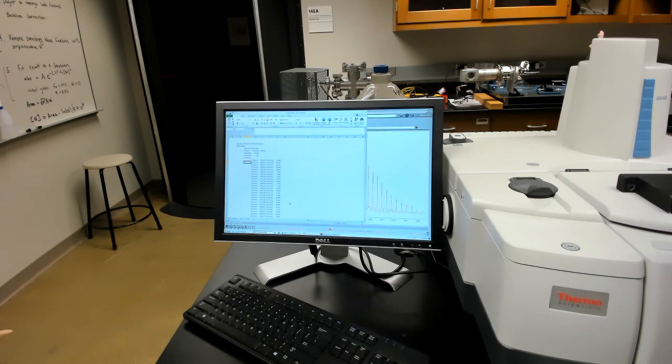In any event, we have our data now, so we're ready to stop, and we'll turn it over to you. You have a peak table and some graphs that you can analyze. Okay, good luck.